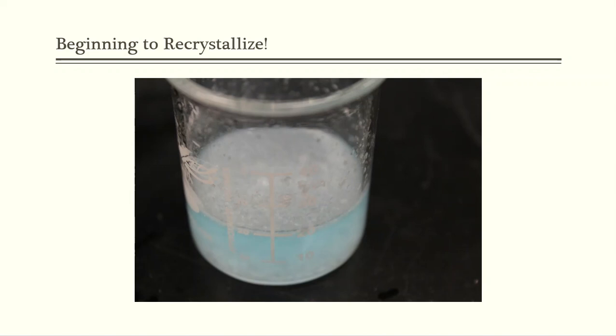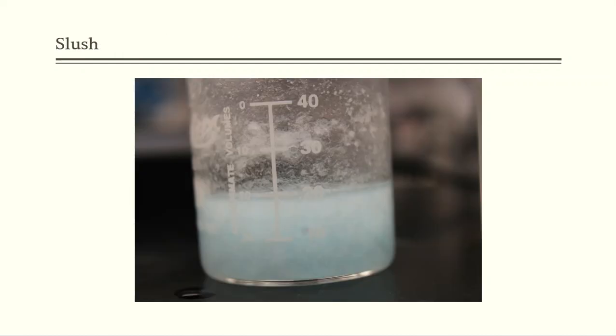So I put the beaker on the countertop. I just let it sit out, hang out, do its thing. And then I came back like 10 or 15 minutes later just to take a look at it to see the progression of it. After 10 or 15 minutes, this is basically what I saw.